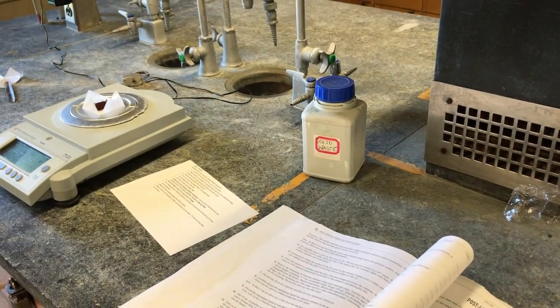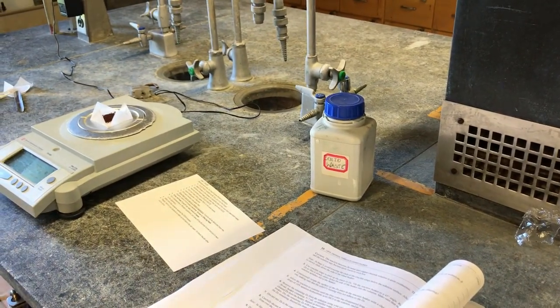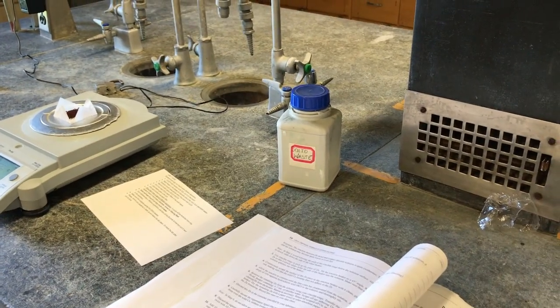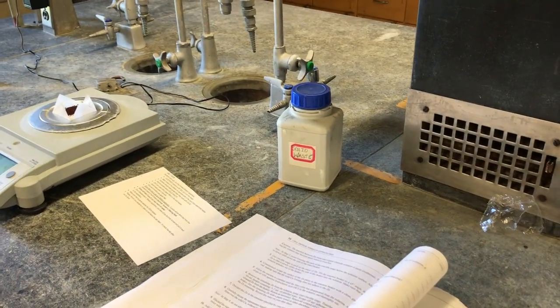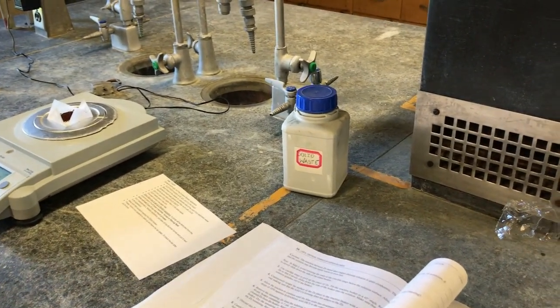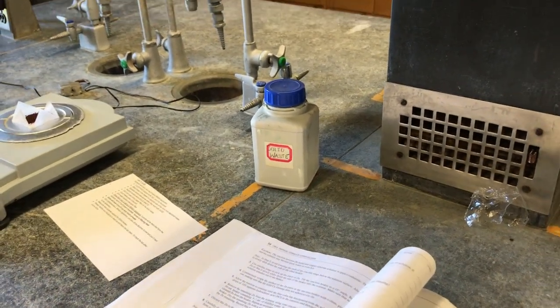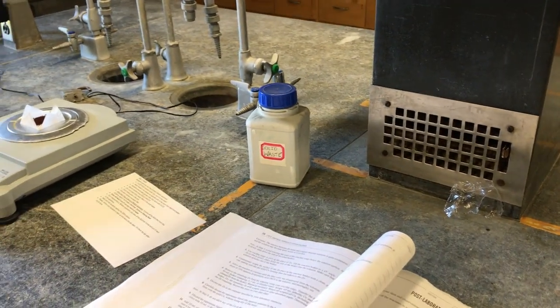So we've waited our extra 5 minutes, and we are within an acceptable difference. It was like 0.002. Well, we are at 0.002, so very happy with that result. We're going to dispose of our copper and our zinc in our solid waste, and then leave you guys to do the calculations. Have a great rest of your day.